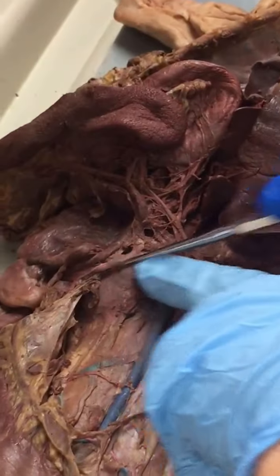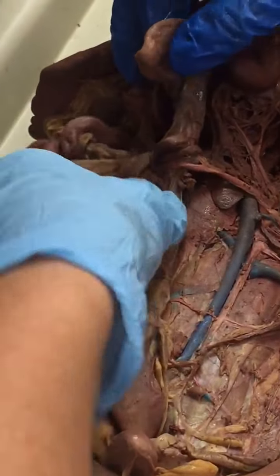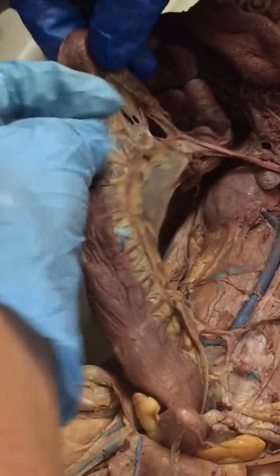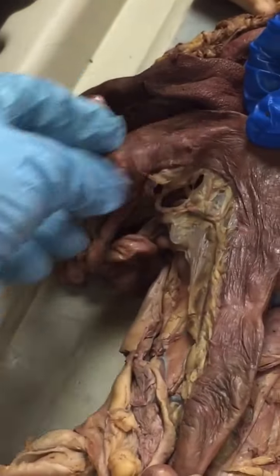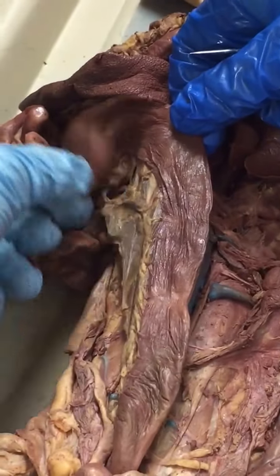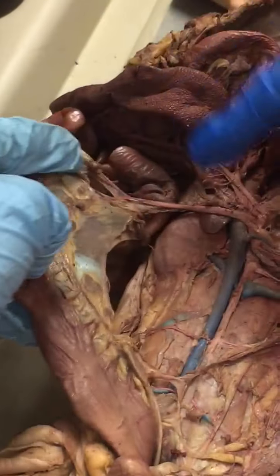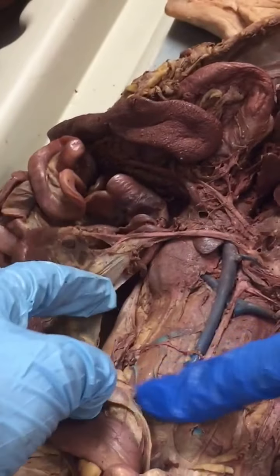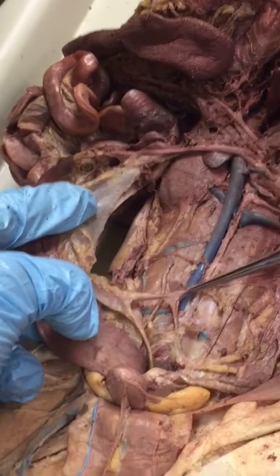Now we're going to go to our cranial mesenteric artery here. Okay. So this, to orient you, this is the descending colon, this is our transverse colon. Remember, this is the cecum, the blind end of the large intestine, and our short little ascending colon. So this is cranial mesenteric artery, and this is caudal mesenteric artery. I think I'll actually do caudal mesenteric first.